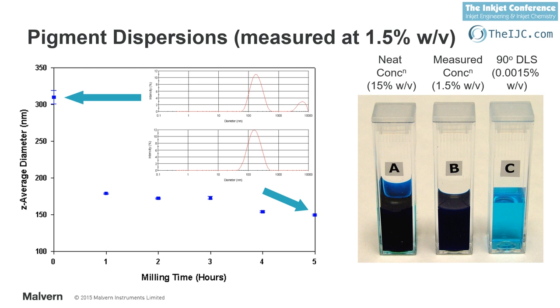Yeah, so that comes back to the two different analyses that are performed on the correlation function that dynamic light scattering uses to get the size information. Primarily, we can get an average size, a Z average size, and an indication as to the polydispersity.